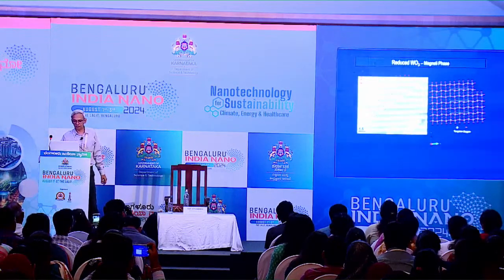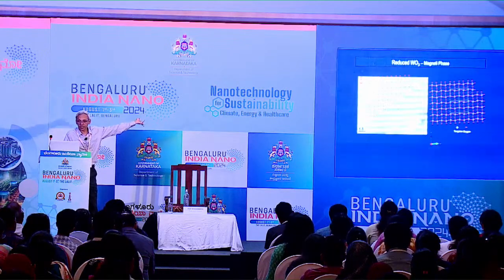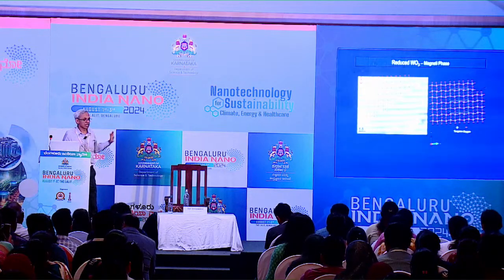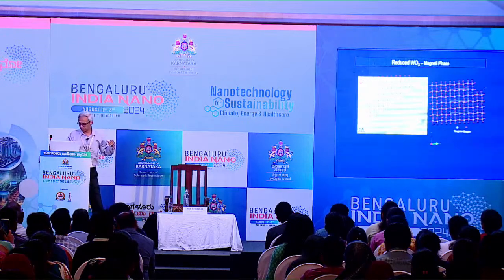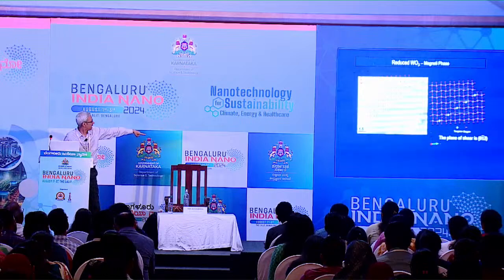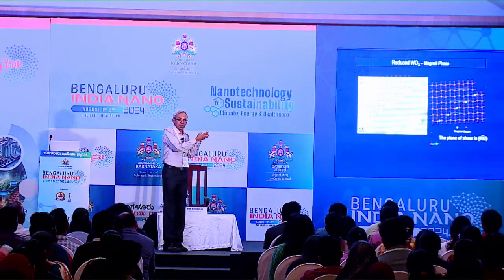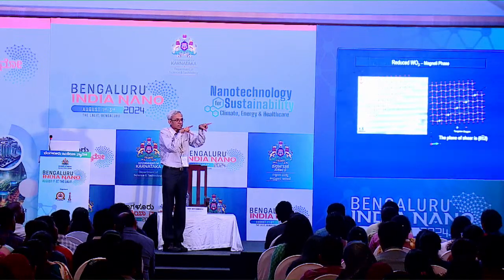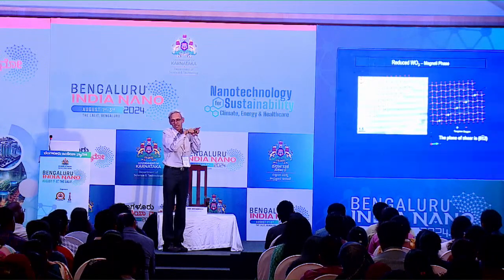Once we have this kind of an image, on the right hand side is shown the pure tungsten oxide structure. You can overlay on that. When we heat this tungsten oxide in a reducing condition, what happens? Oxygen goes away, and oxygen goes away only along specific planes. So if you remove specific planes of oxygen, the yellow dots that I'm showing there, then we have tungsten oxide octahedra that have only lower coordination instead of 6 coordination. Therefore, the whole structure shears, so that instead of corner sharing, they become edge sharing.